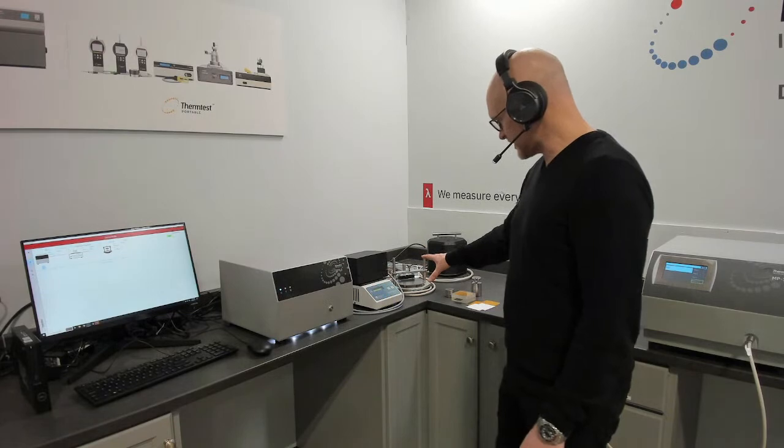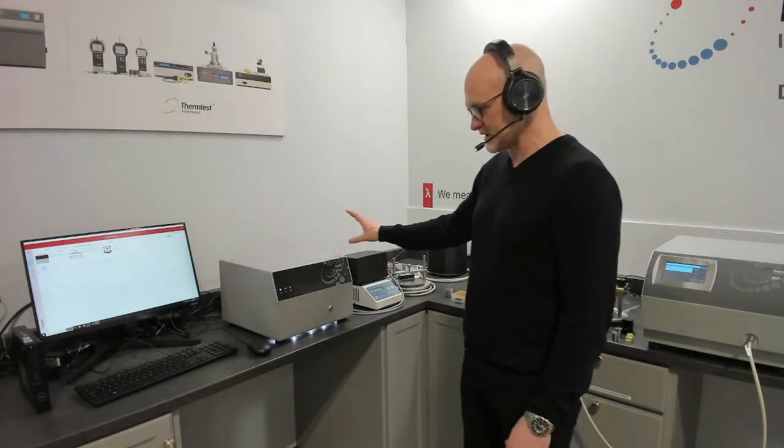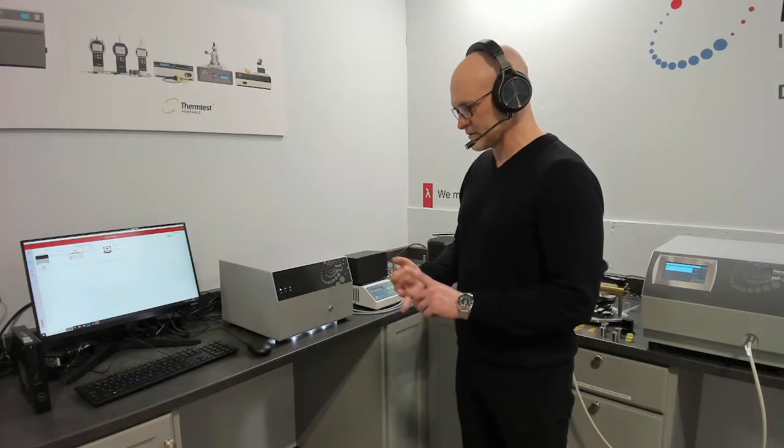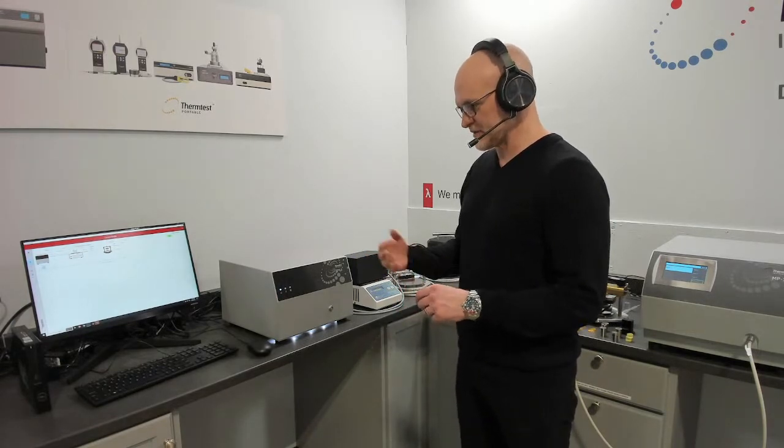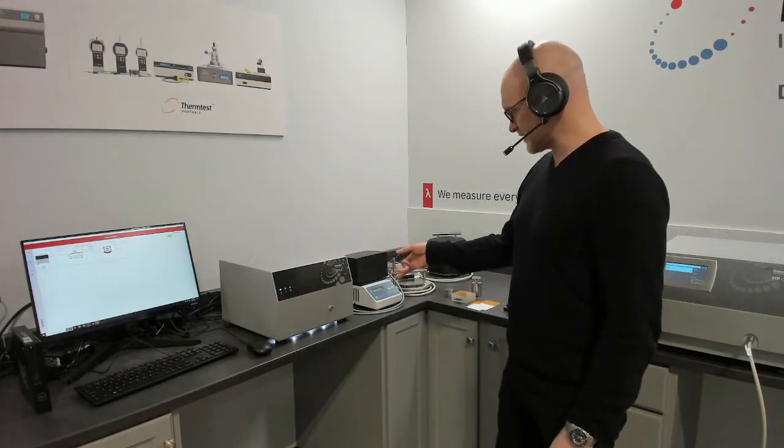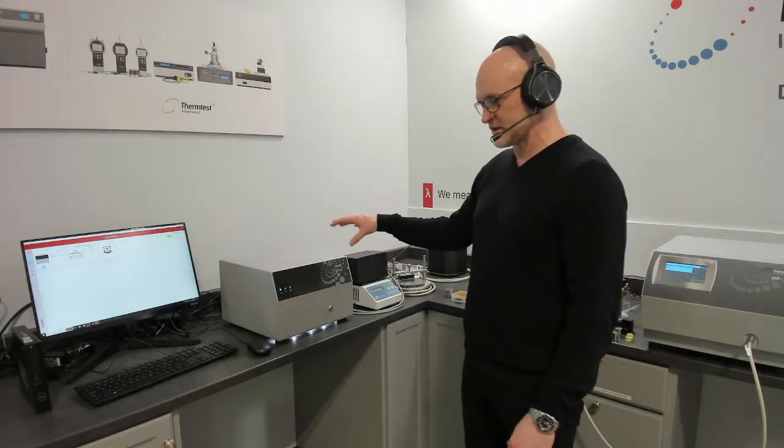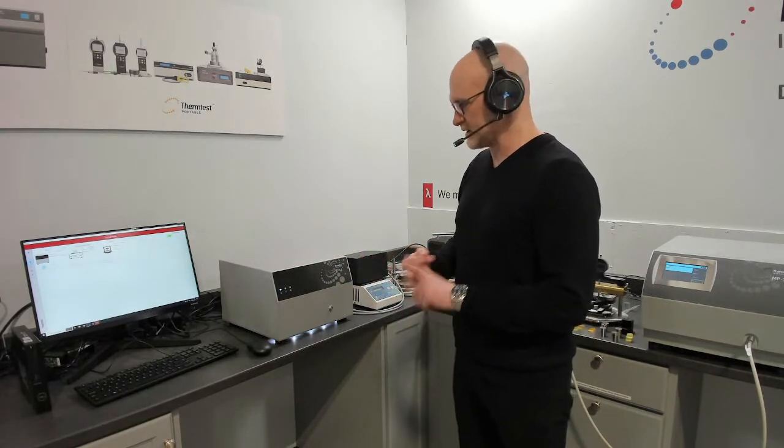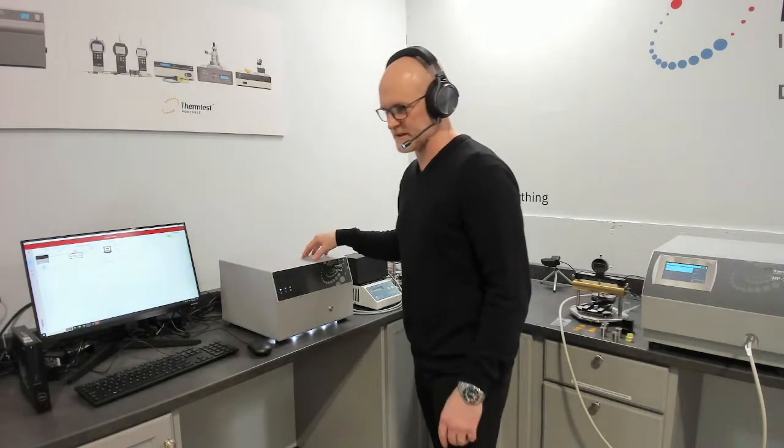It can be configured with room temperature and temperatures up to 300 Celsius. It is used for measuring bulk thermal conductivity, thermal diffusivity, volumetric specific heat, and calculated thermal effusivity. It can be configured with single-sided testing as well as two-sided testing and for measuring anisotropic slab metals and thin films which is what we're going to actually talk about today.